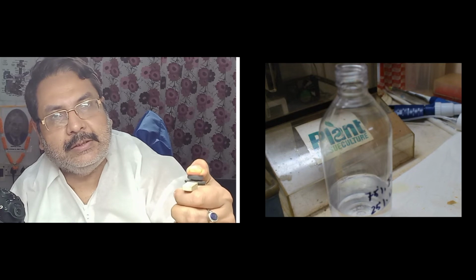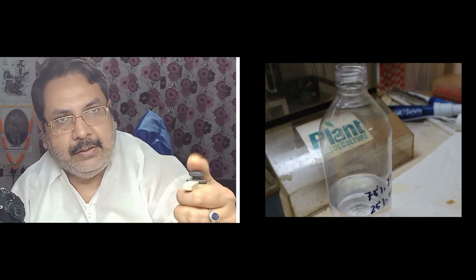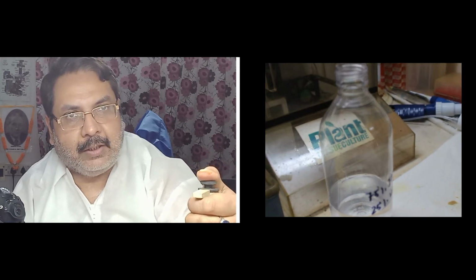So how can we take up the liquid? This is our volume plunger, and this is how to hold the auto pipette. Here is a dial. You can see in the camera, this is from 20 to 200 microliter. It is clearly written over there. So this is from 20 to 200 microliter.